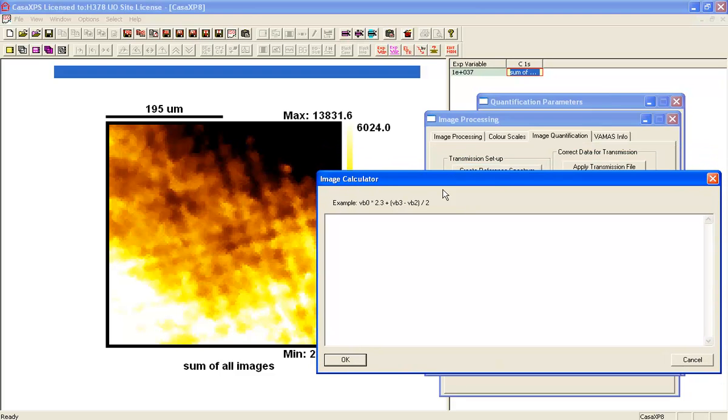So there's a window I can bring up, and this image is 128 by 128. So let me just introduce a calculation of the number of pixels, and I'm going to divide that by a scale factor which will give me, if I calculate a normalized image, if I multiply the normalized image by the scale factor, I will get intensities within the image that are characteristic of the film thickness from a bulk material. And this is not precise.